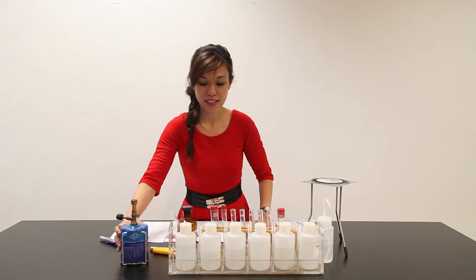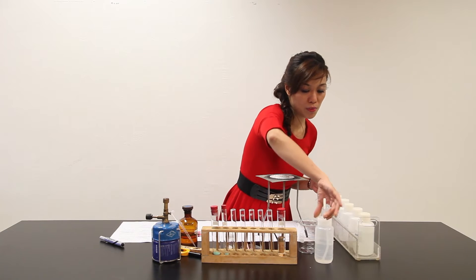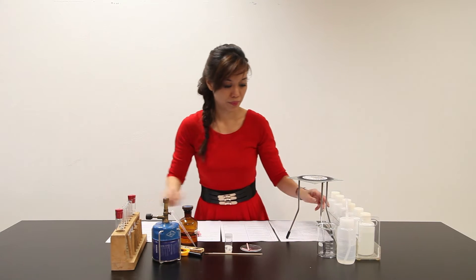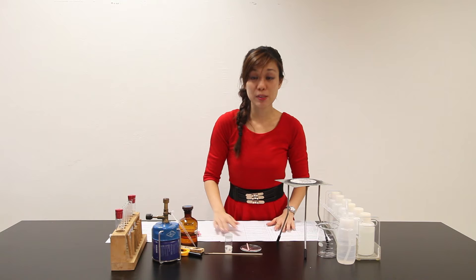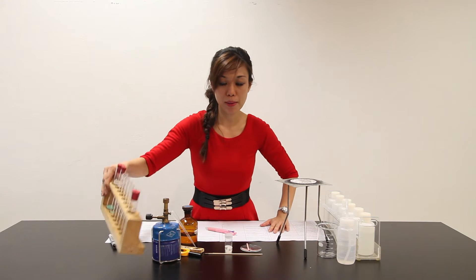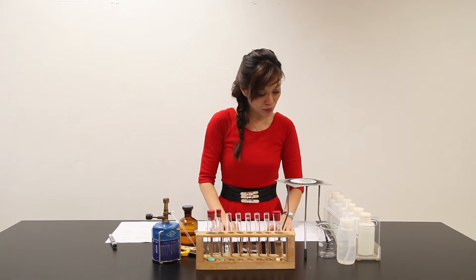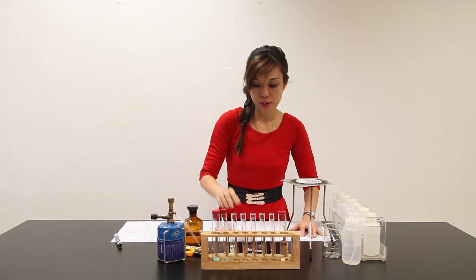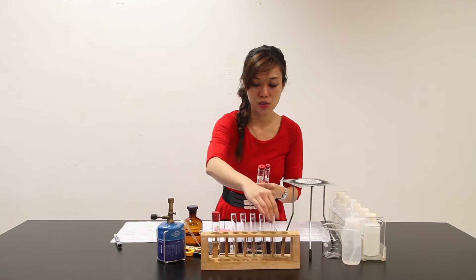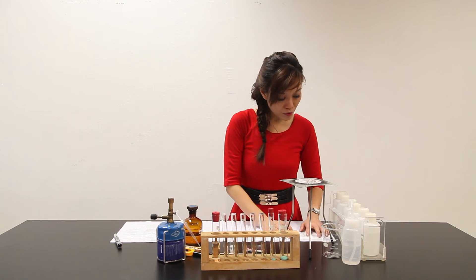First of all, let's remove the clutter and bring the reagents to one side. Let me rearrange the position of the test tube. Carry on the following experiment.